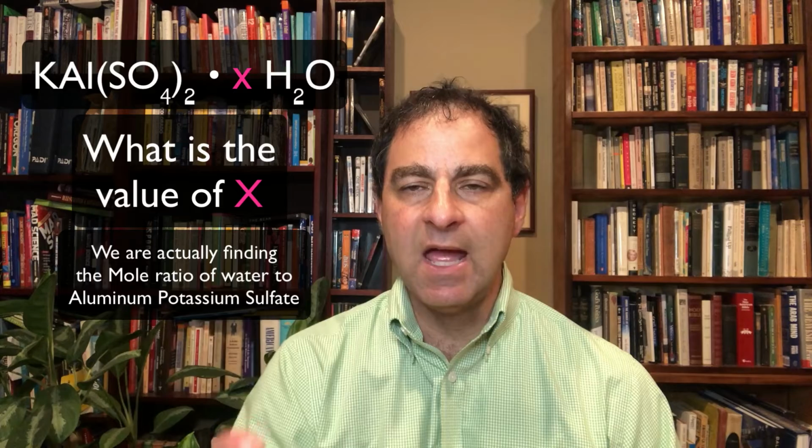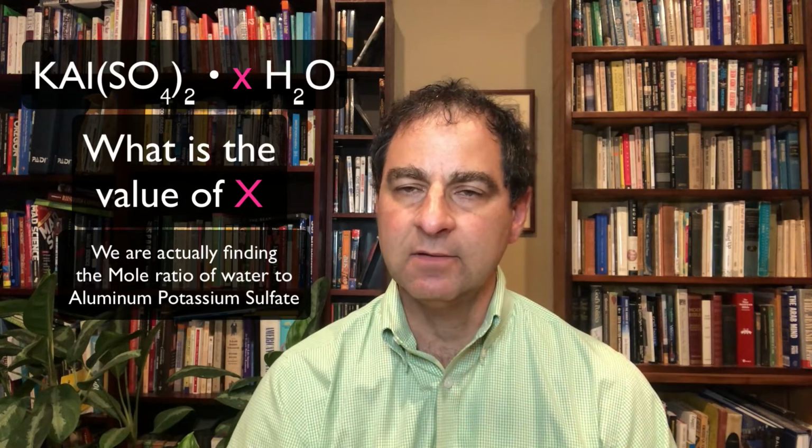The second part of the lab is going to take alum. The chemical name for alum is aluminum potassium sulfate. This is something called a hydrate. Many chemicals are hydrates. When it sits in air, it will attach to waters from the atmosphere. And so alum is actually a hydrate. It has some number of waters attached to the molecule. Our goal is to find the waters of hydration. How many water molecules are attached to each alum molecule?